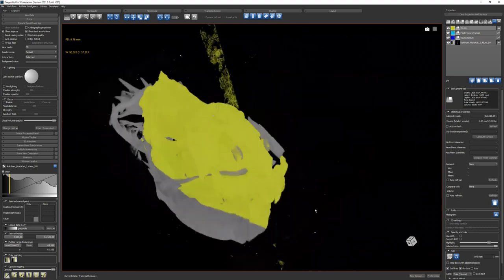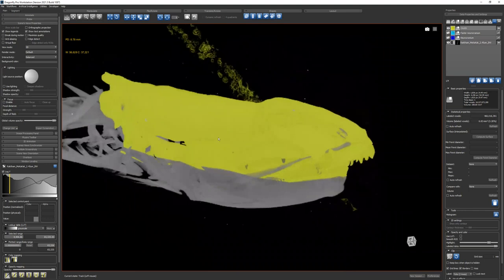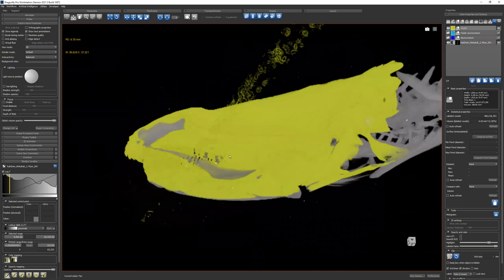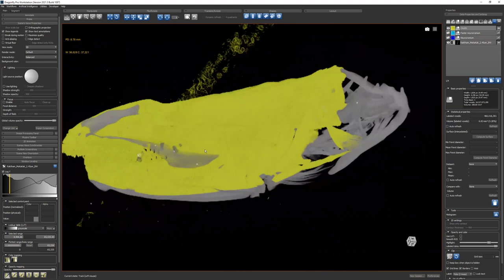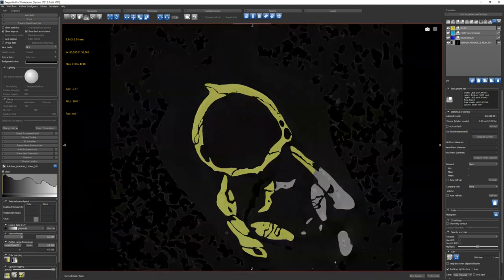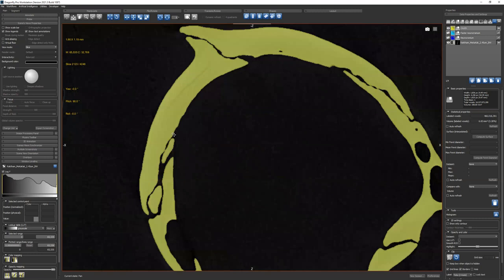So let's say this is our perfect segmentation, and we're going to now use it for some project where we want to visualize our segmentation alone. So the way we're going to do that, and the way we're going to save this forever and ever, is something I just recently started doing. It is going to be our first step.